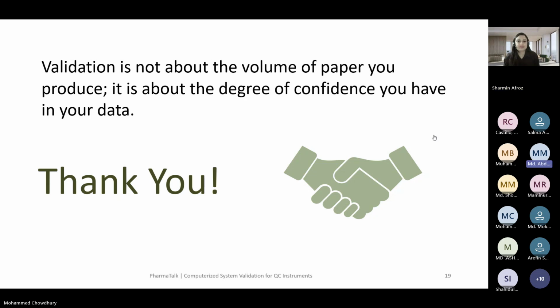And for CSV or 21 CFR Part 11 compliance, we have different kinds of instruments in our lab. Say, for a water bath, for 21 CFR Part 11 compliance, what should we maintain in our facility? Will it be okay to maintain a logbook and nothing else? I just want to know the different requirements for different kinds of instruments. For the HPLC system, we know the requirements and they are well discussed, but for other instruments, it is not discussed that much.